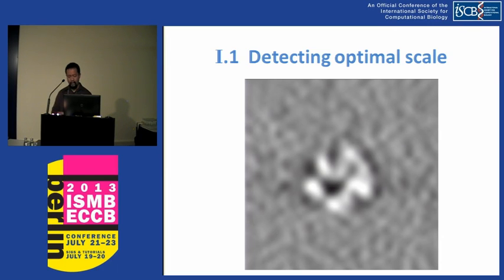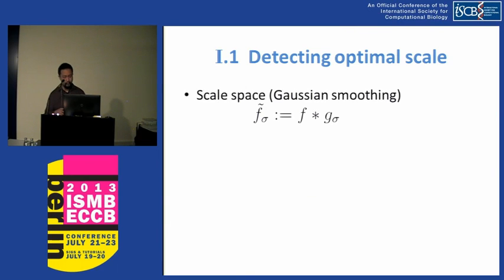And at the same time, the surface of the complex is surrounded by a negative intensity surface due to the nature of the electron microscopy imaging process.